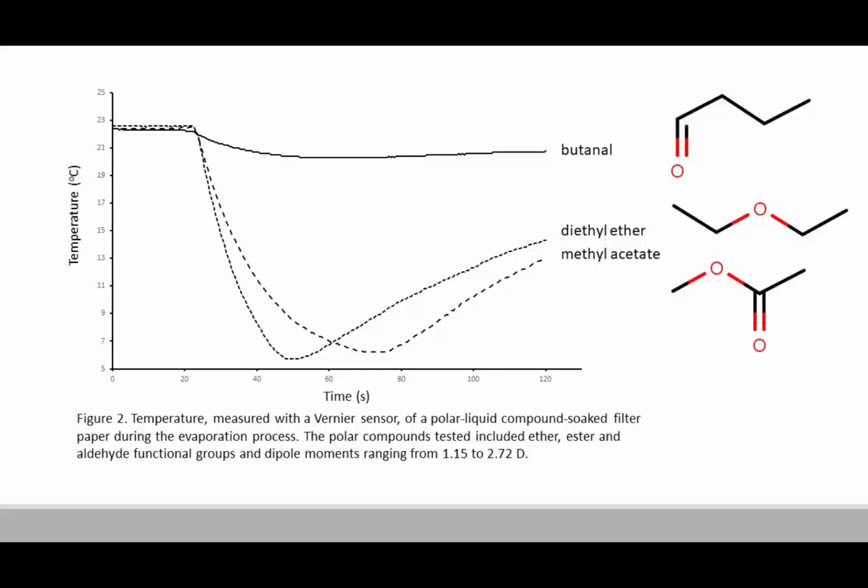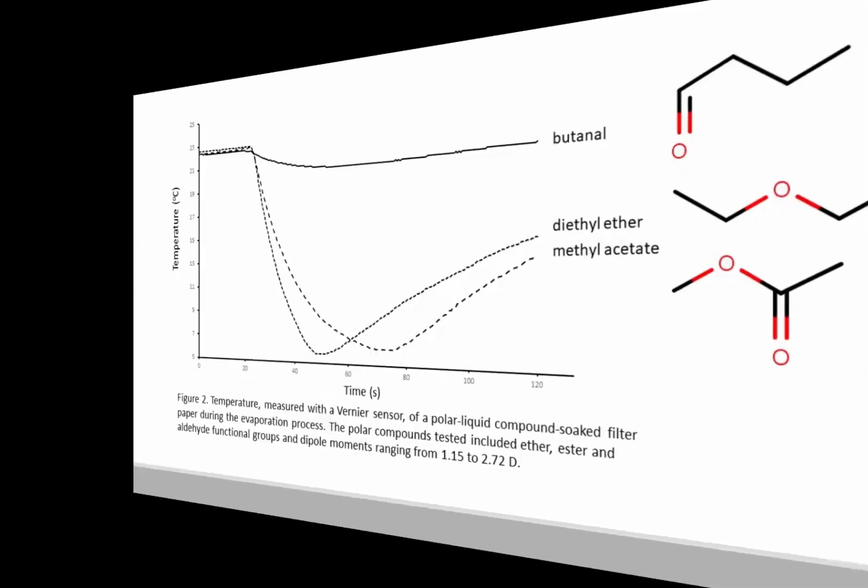A possible explanation for this is that the liquid sample has all evaporated by this point. It is likely that the maximum change in temperature is, therefore, not achieved for these examples. For this reason, it is generally believed that the initial rate of temperature change is a better reflection of the relative strengths of the intermolecular forces.